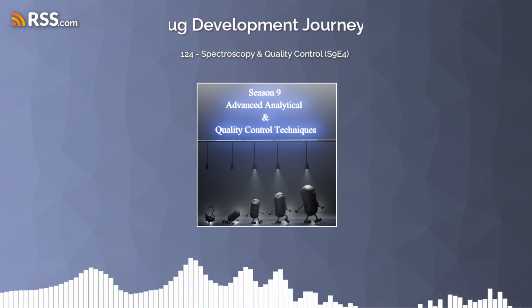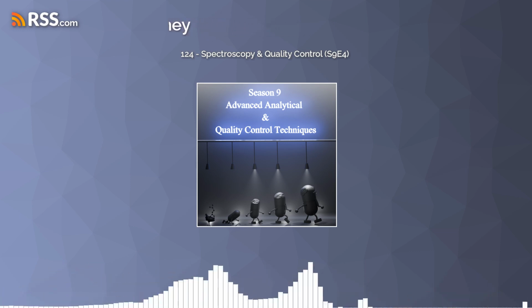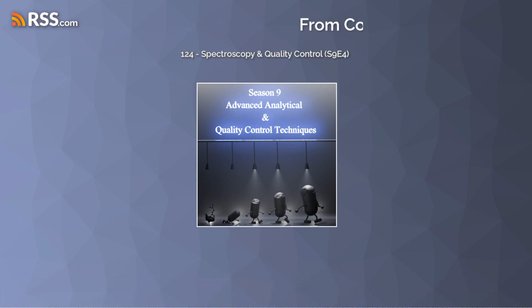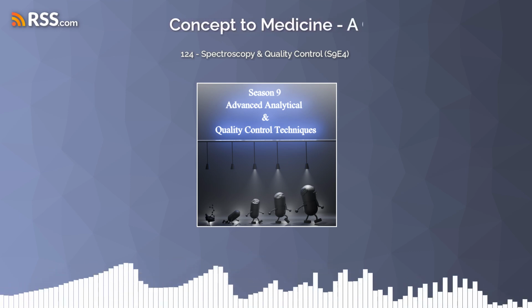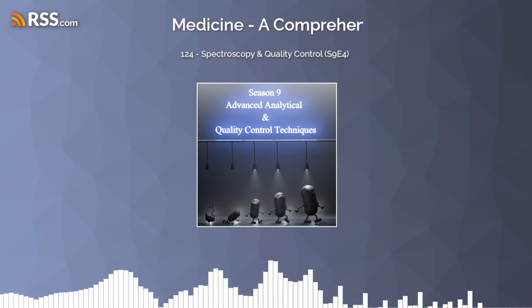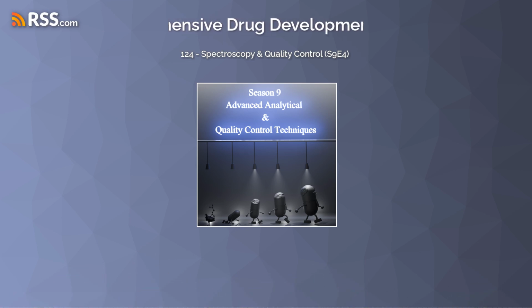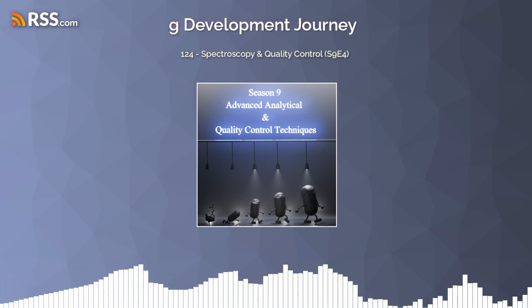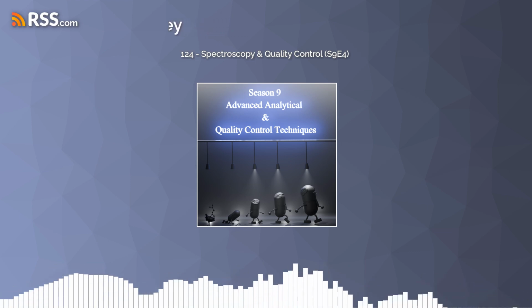You were saying that this technique has some advantages over the others. It does, in some cases. One of the cool things about Raman is that it can often be used for non-destructive analysis, meaning you don't have to destroy your sample to analyze it. So you can imagine if you had a sealed medicine, you could actually analyze it through the packaging without ever having to open it.